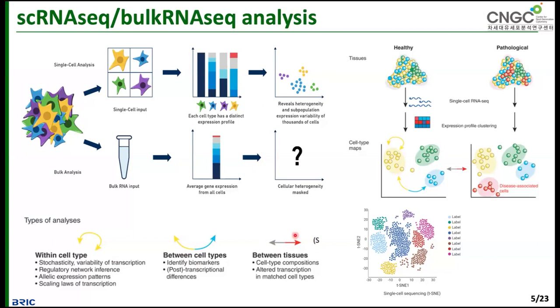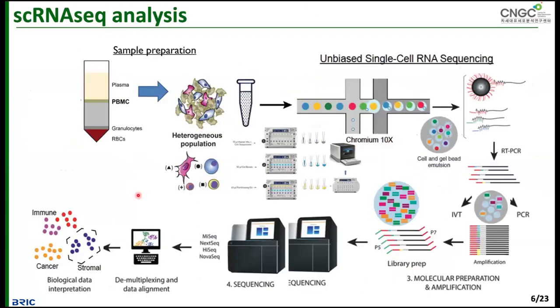Finally, we can clearly separate all the cells from this heterogeneous environment, and we can see the individual cells very clearly by performing some data analysis after this result. So this is why single cell RNA sequencing is the advanced technology to explore in a very comprehensive, more detailed and more precise way, and we can get a clear result when compared to the traditional bulk RNA sequencing analysis. So this is the difference. I hope you can understand very clearly.